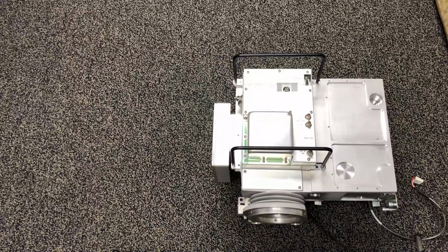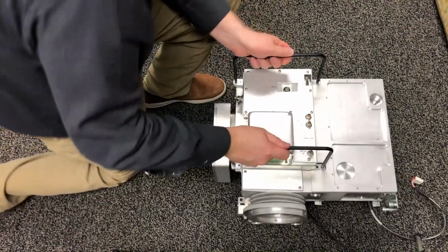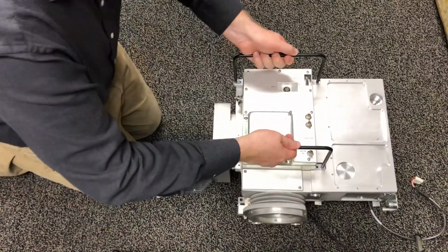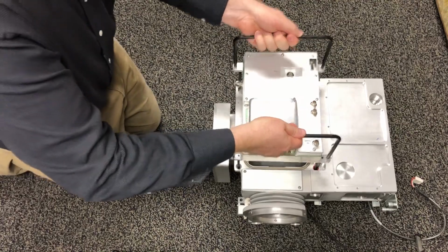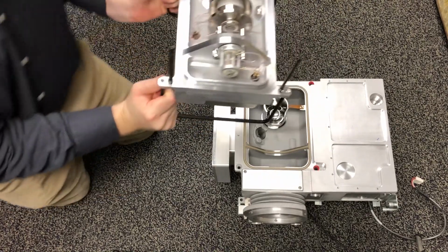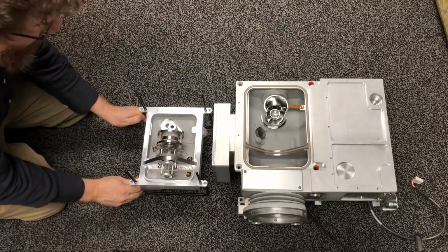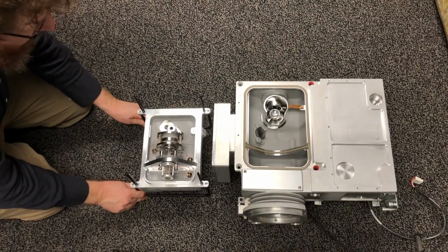Let's talk briefly about detectors. They're worth talking about. Sometimes I trash talk detectors, but they're actually the unsung heroes. They're quite wonderful. We're going to talk about one particular kind of detector, the electron multiplier, and that is the detector that this instrument has, and a lot of mass spectrometers have electron multipliers.